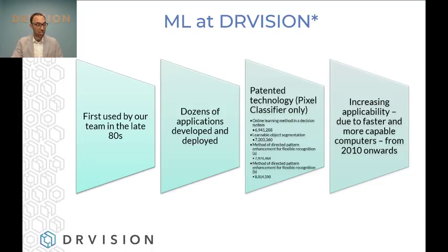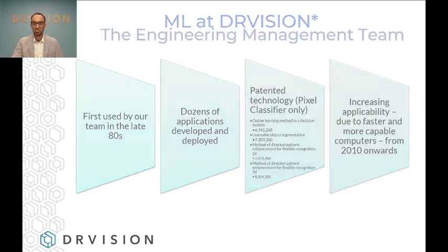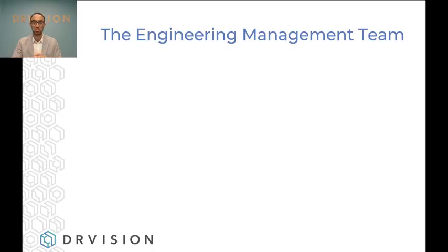So now we decided to bring it into Aivia, which is our flagship product, and we'll talk about that during the rest of this presentation.